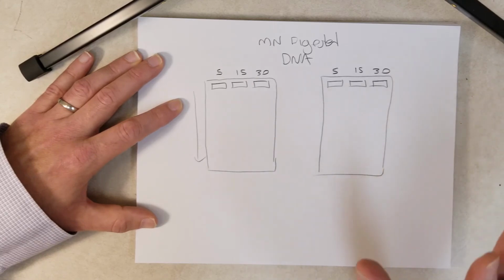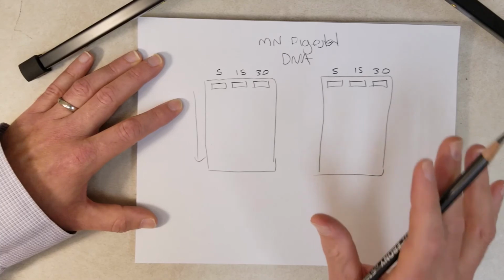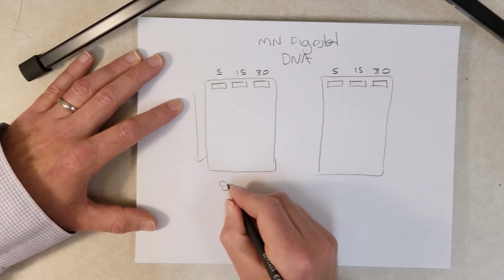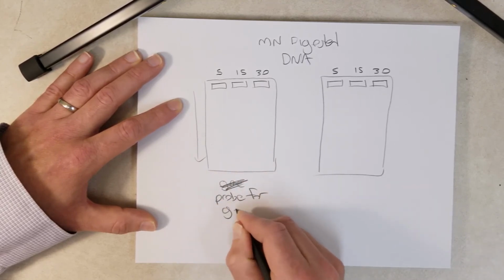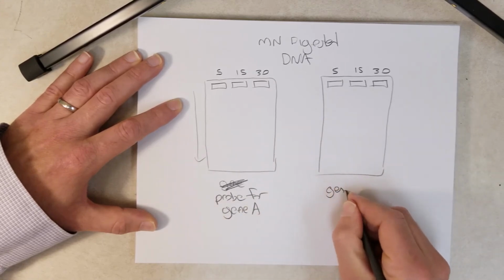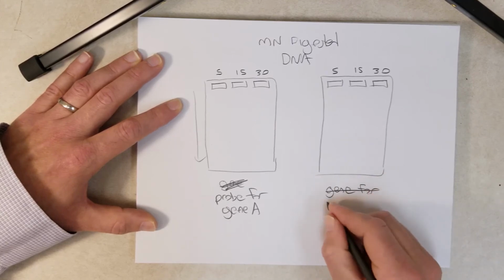We only want to see DNA that has sequence complementary to either gene A or gene B. So over here, we are going to use a probe for gene A. This is essentially a Southern blot, which we haven't gone over in detail, but let's do one technique at a time.